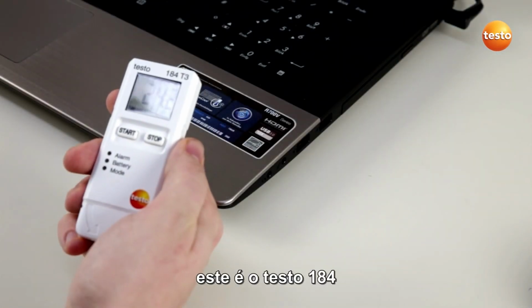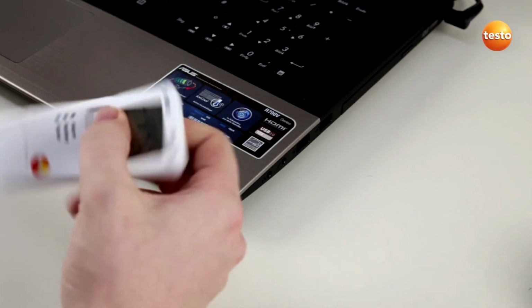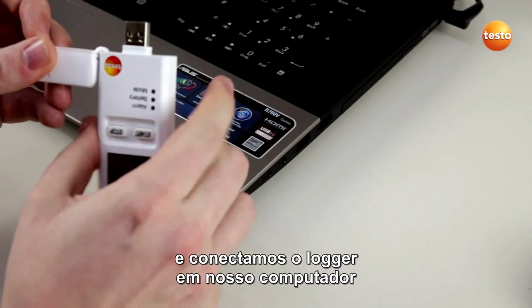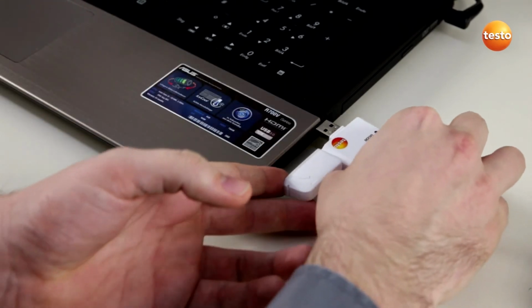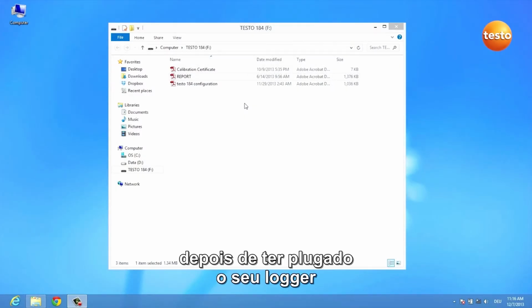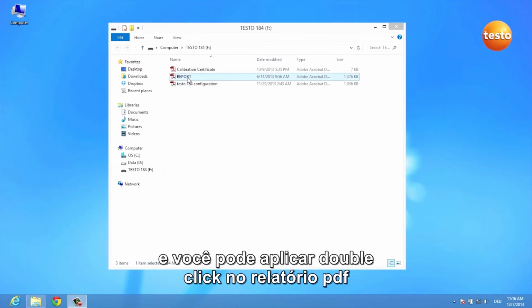This is the Testo 184 and today we show you how easy it is to read it out. Therefore, we simply take off the USB cap and plug the logger into our computer. After you've plugged in your logger, a window opens which shows you your USB data logger's drive, and you can double-click on the report PDF.